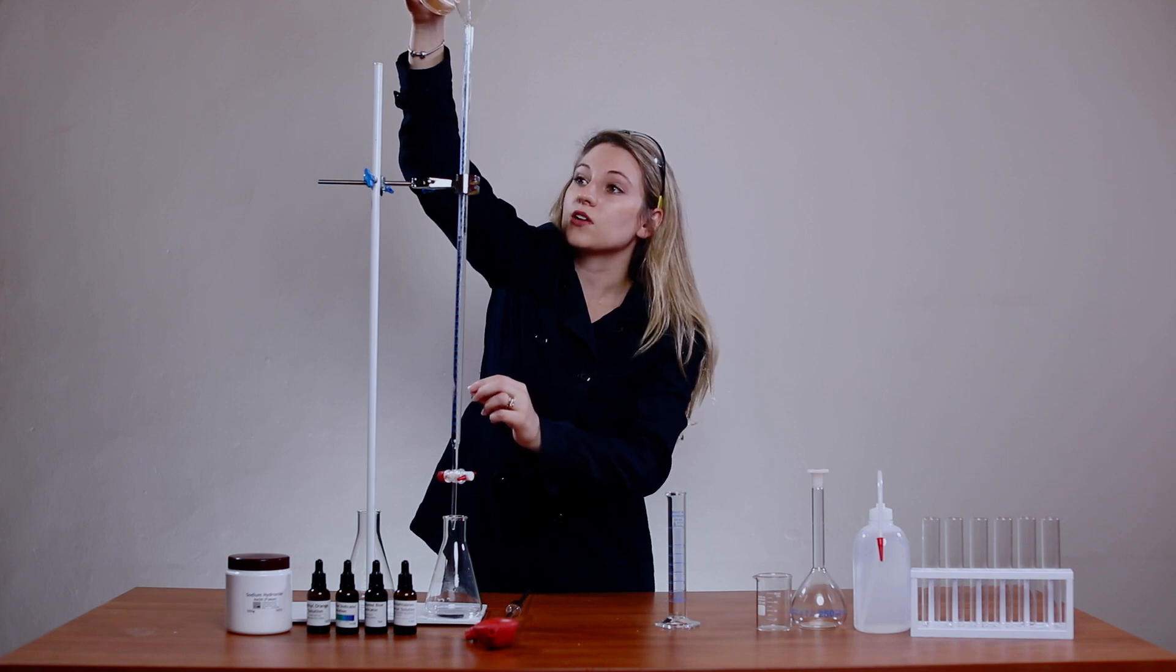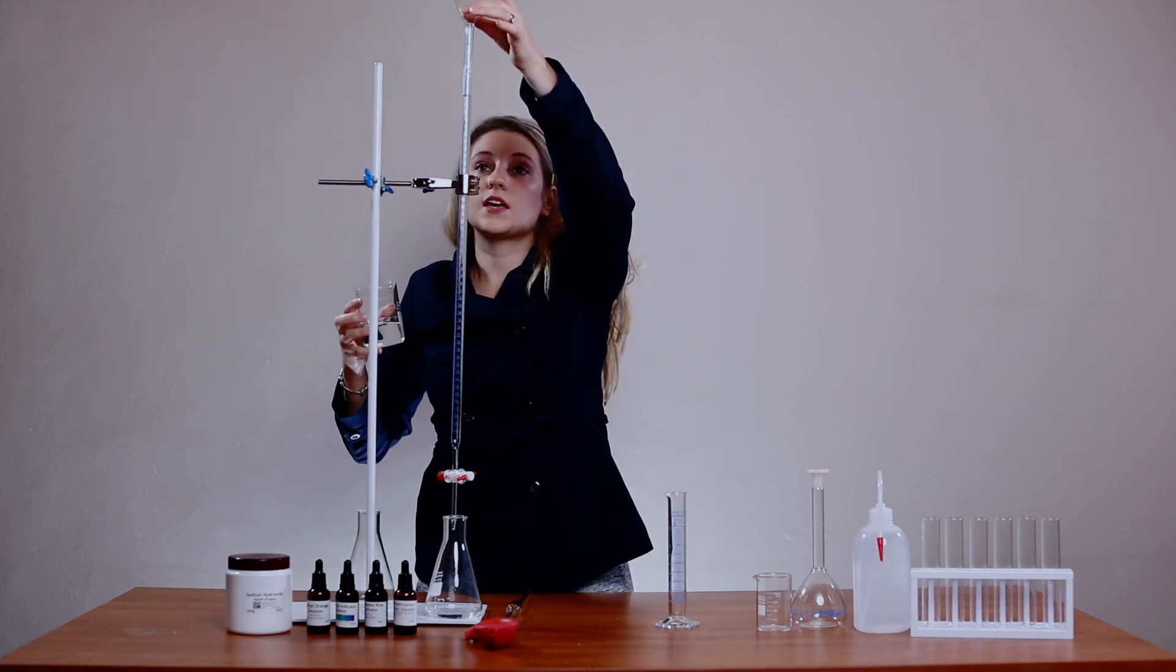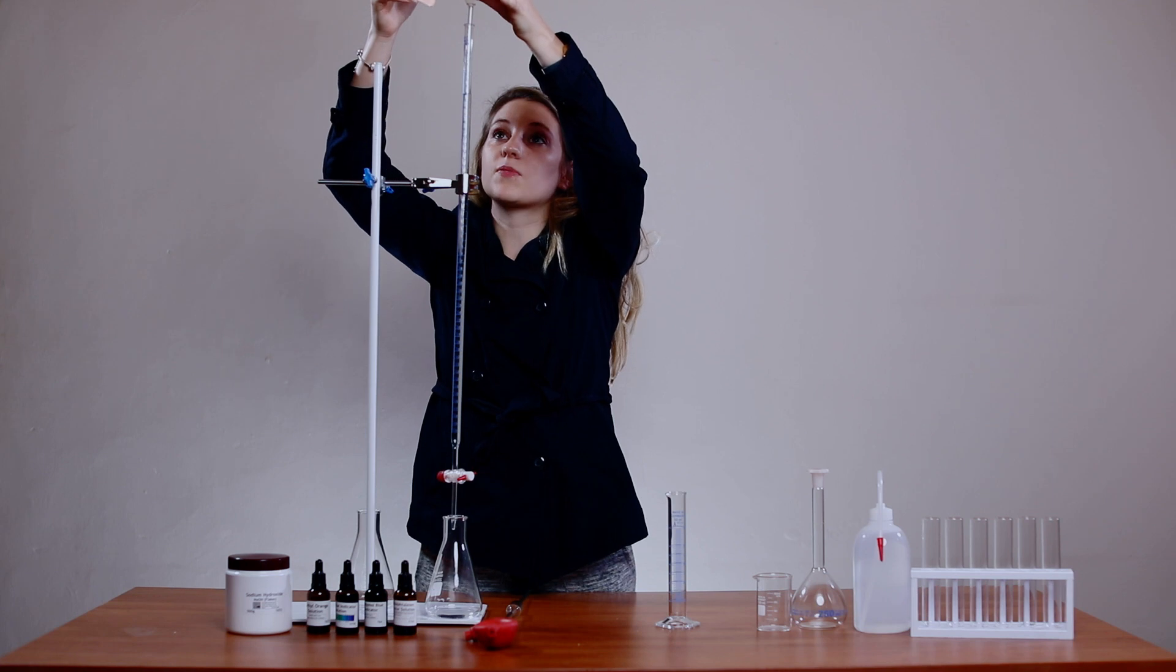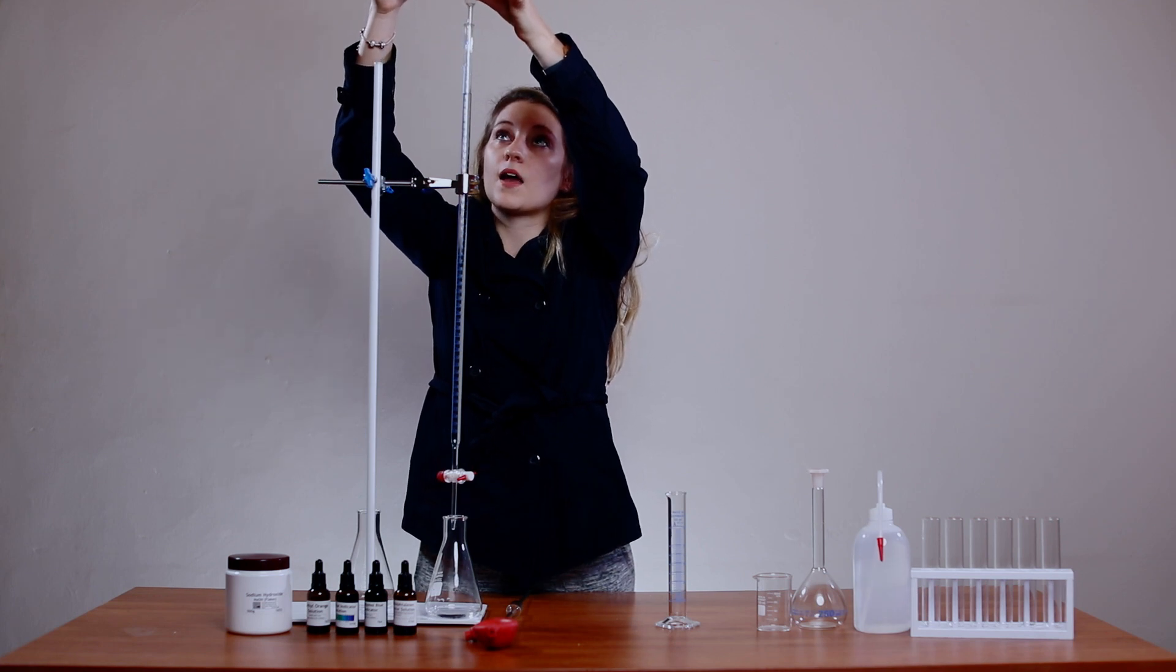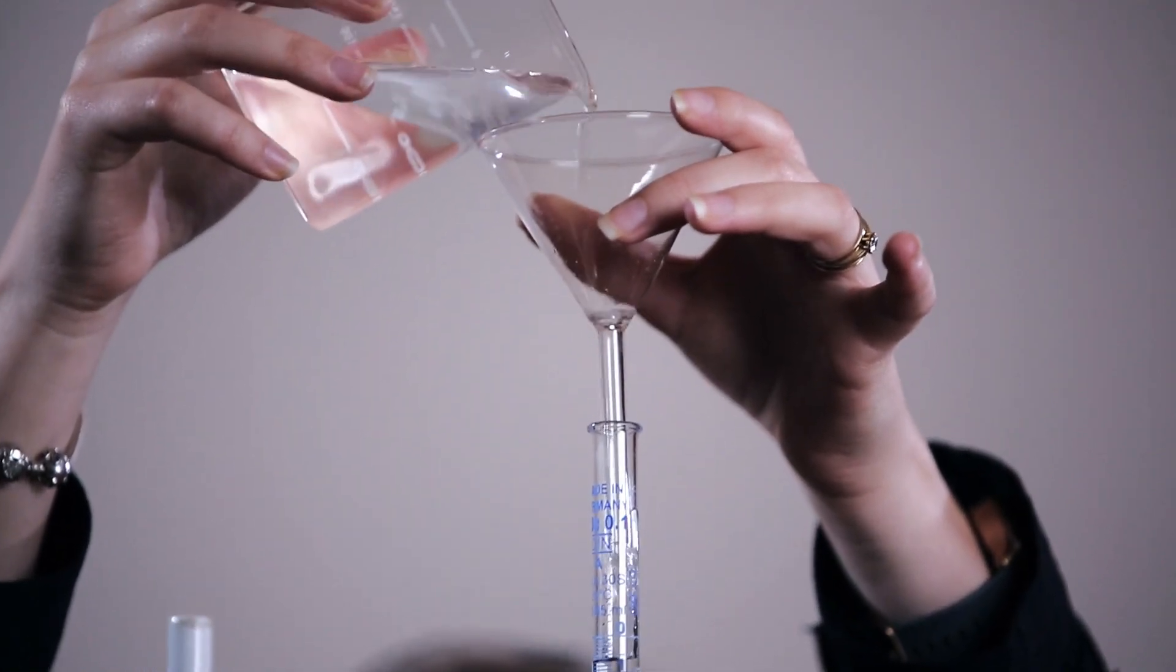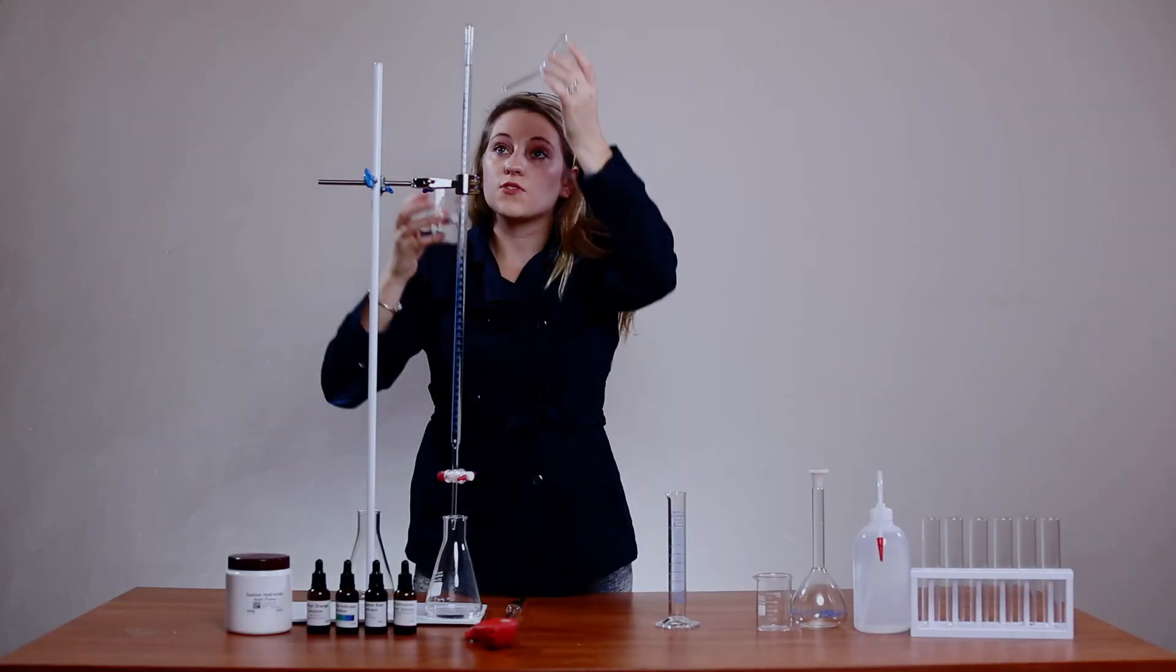You will see that it starts to fill. When it gets to this point here and it's almost at zero, you can just lift up your funnel and just add in that little bit of extra liquid that you need to get to exactly zero.